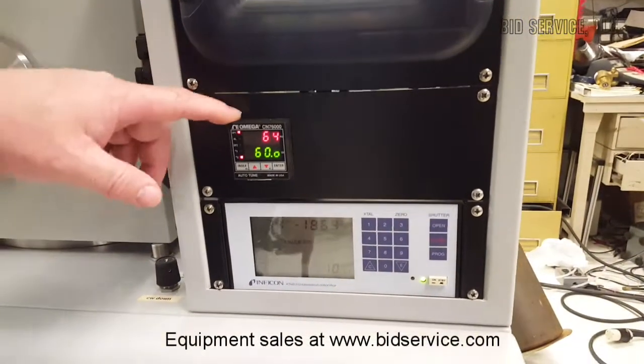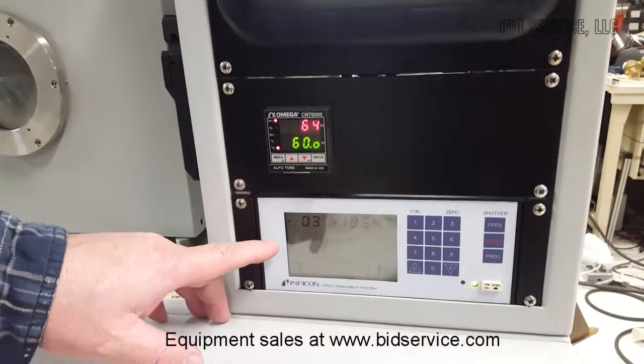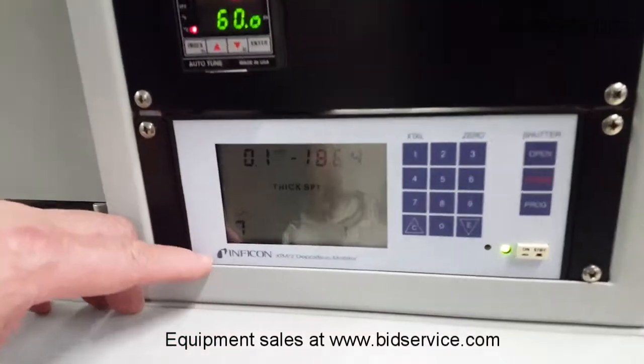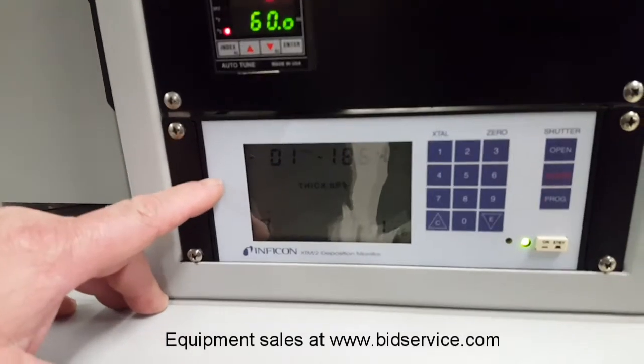Down here is your temperature controller. This has a substrate heater and it's good for a hundred degrees. Down below this is your Inficon deposition monitor — it doesn't control the deposition, it just does the monitoring part.